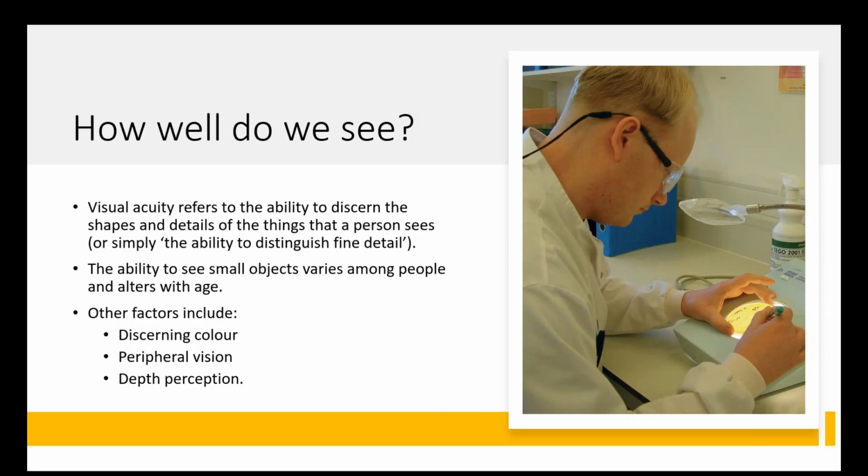So for these reasons, where we are carrying out more conventional colony counting, again, as shown on the picture, there's a standard colony counting device, then assessing vision periodically for someone whose job is to count colonies in the conventional sense is quite important to make sure that person is still able to count colonies over time.